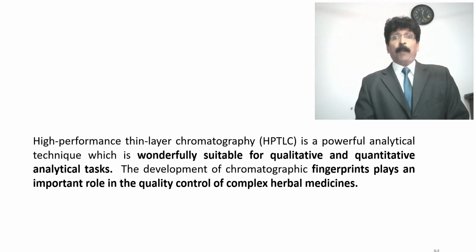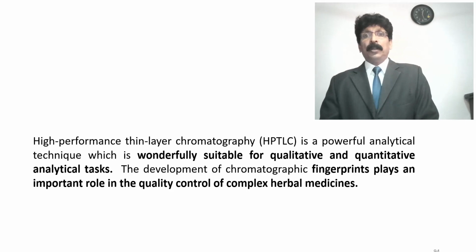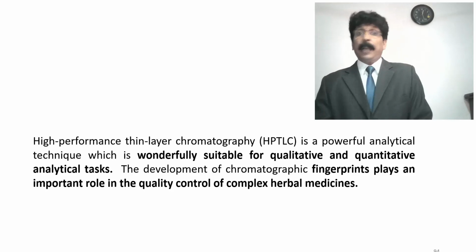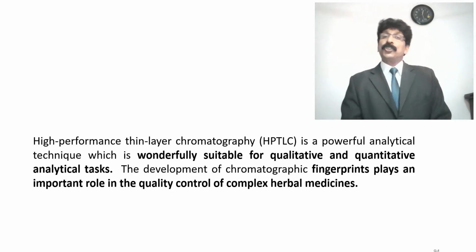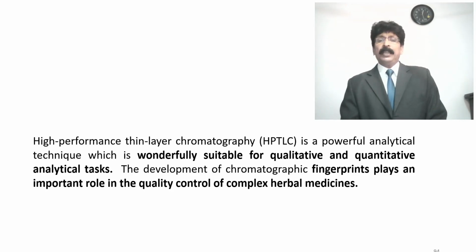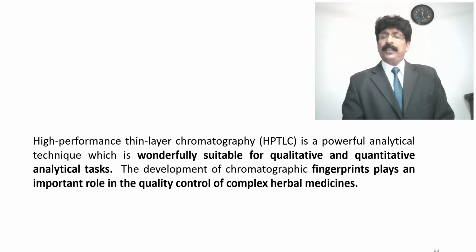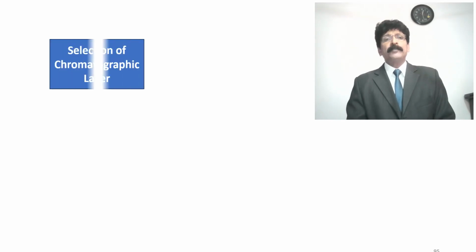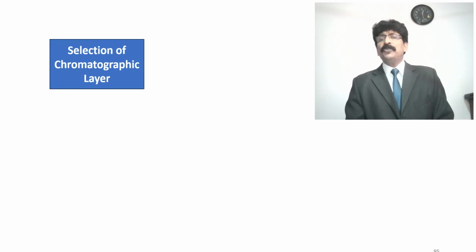It's an important thing which has to be noted. WHO also insists on knowing about multi-drug formulations, their therapeutic activity and their constituents. Doses are very, very important to know about the safety and efficacy of herbal drug usage. First, here we should know about the selection of the chromatographic layer.